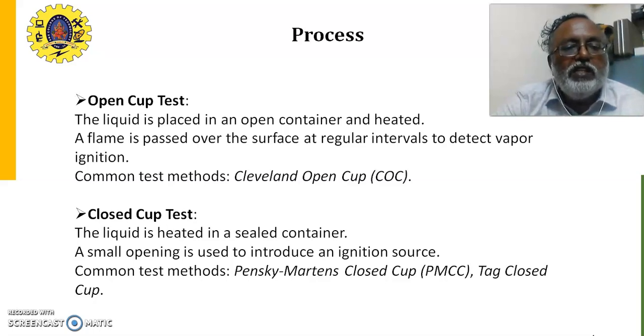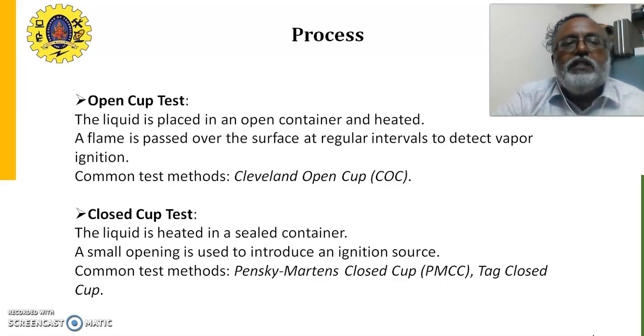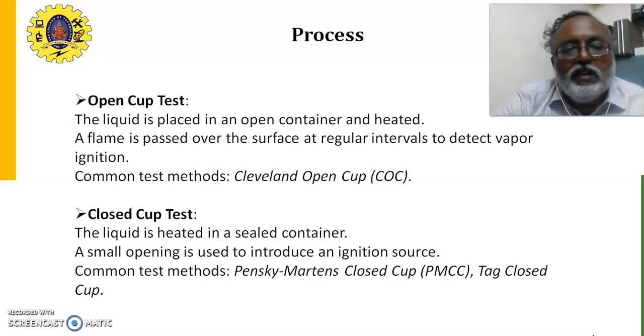In the closed cup test, the liquid is heated in a sealed container. A small opening is used to introduce an ignition source. Common test methods are the Pensky-Martens closed cup test and the Tag closed cup test. So, in the open cup test, the liquid is placed in an open container, and in the closed cup test, the liquid is placed in a closed, sealed container.